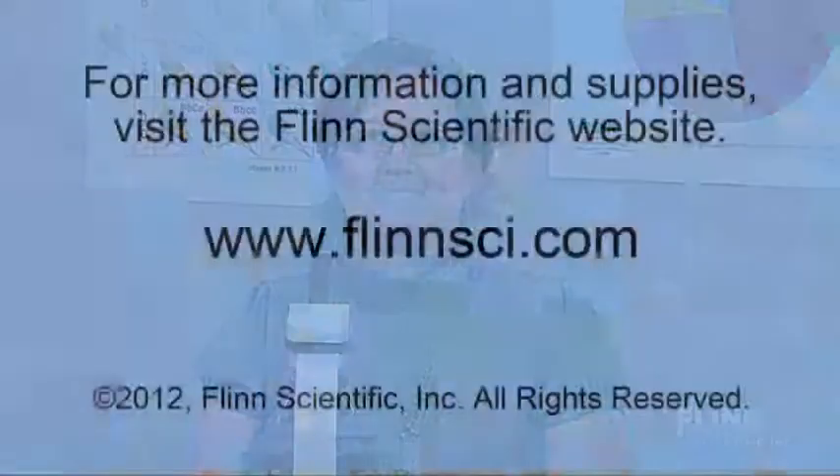Spending a little time every semester maintaining and cleaning the microscopes will save your students and yourself a lot of frustration and ensure that your microscopes have years and years of use.